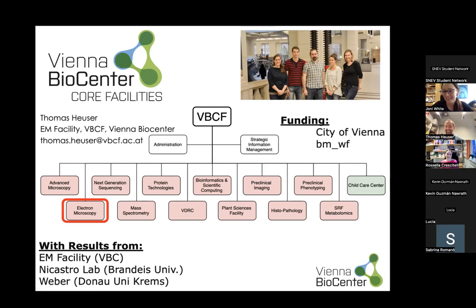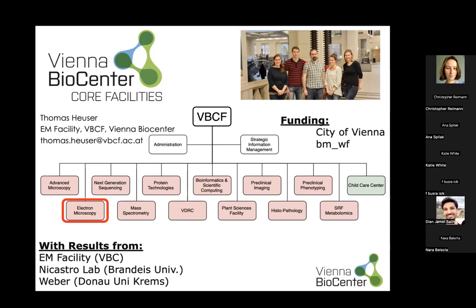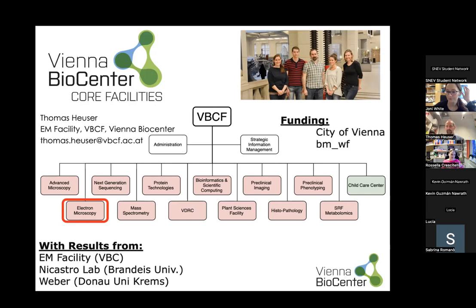Hi, Thomas. Always really clear and super nice. Probably, as you know, I do a lot of negative stain on the vesicles. Unfortunately, not cryo. Anyway, I do a lot of it, and I have more than a question, I have a curiosity. You show that when you do negative stain, basically you put the vesicles on top of the grid and you wait a little bit, and then they will be there, and then you go to the microscope.